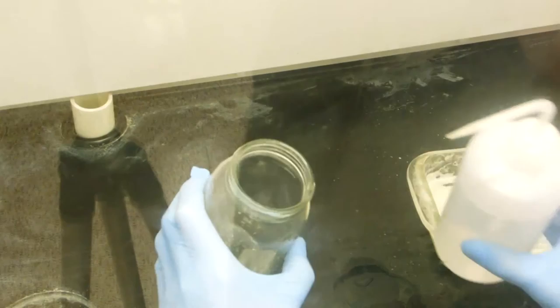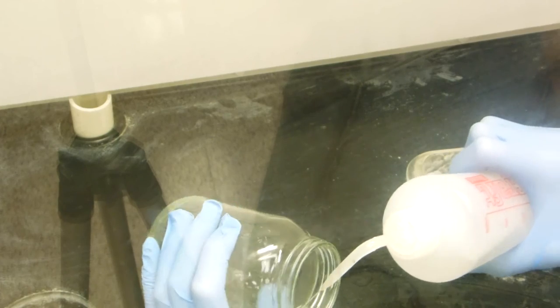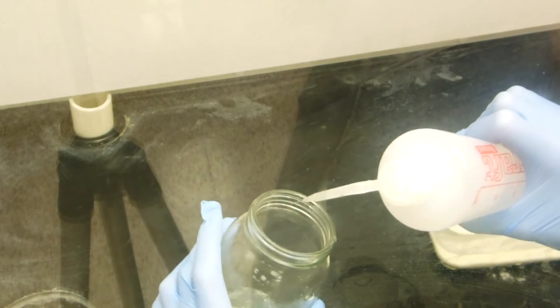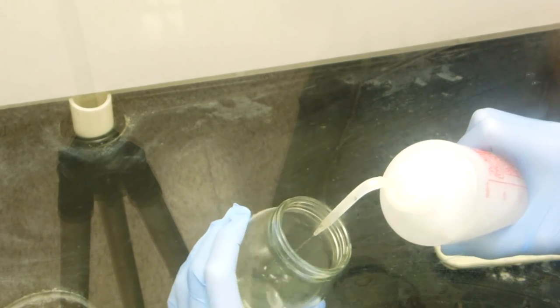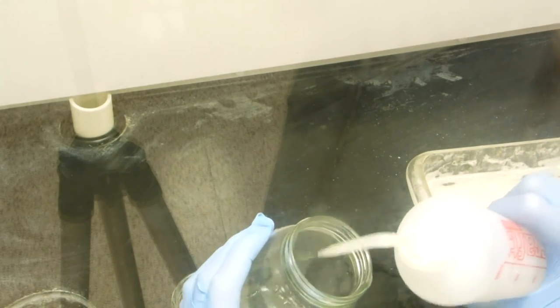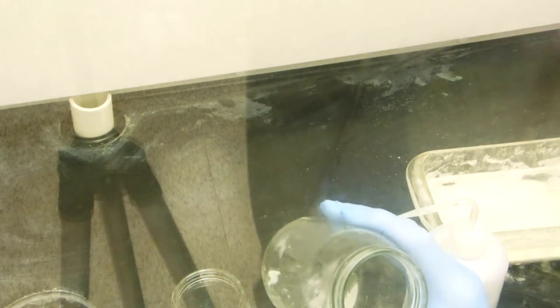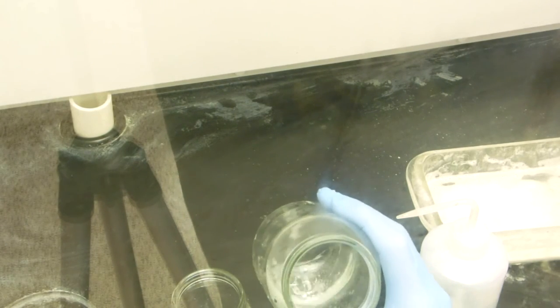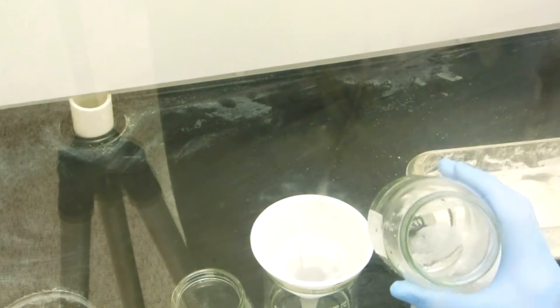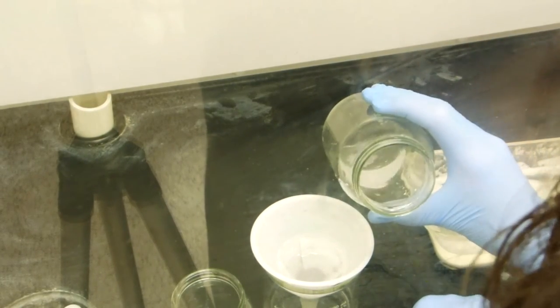So I will now use a wash bottle that's just deionized water and rinse out the jar to get the rest of the silver chloride out. You can still see the large amount of silver chloride powder still present in the jar, so I add a small amount of deionized water to regroup the silver chloride into one place. This is very time consuming. So you could just see the silver chloride at the bottom. And yeah, there you go. You can see all the powder.